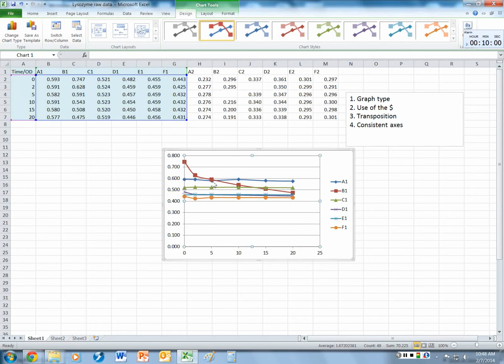In order to make all the numbers look like that, we divide all the numbers in the column by the starting OD, the one at 0 time. Okay? So, first thing I'm going to do is copy and paste the numbers here, the times, and put those here.